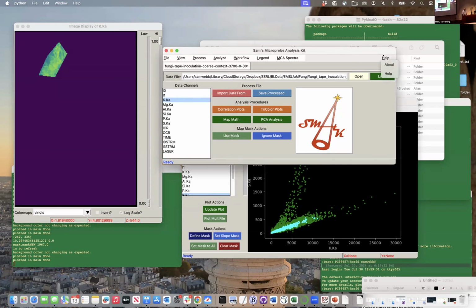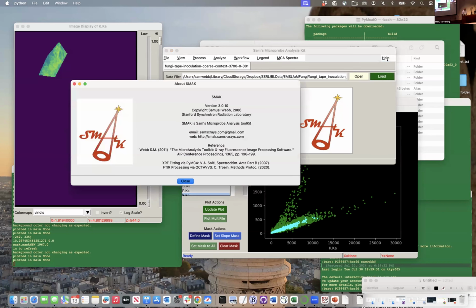And if I ever ask you what version you are when you report errors, you can always go to the About page. And I'm cheating because I'm actually on my new version. That's 3.0.10. So shh, don't tell anyone. It's just not released yet.